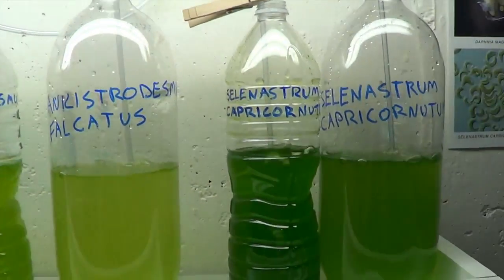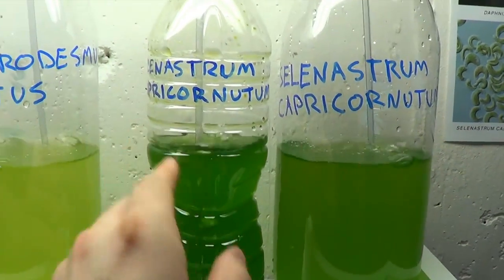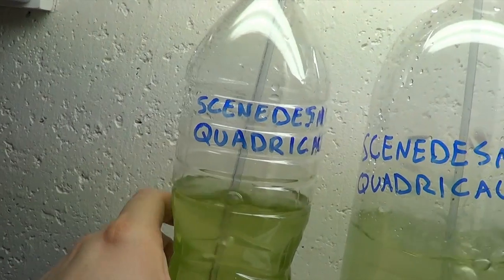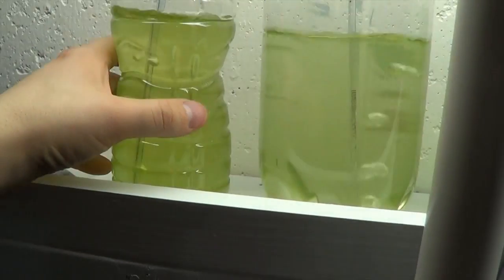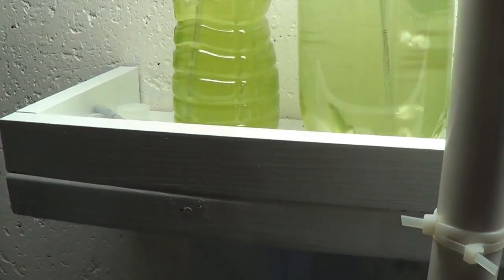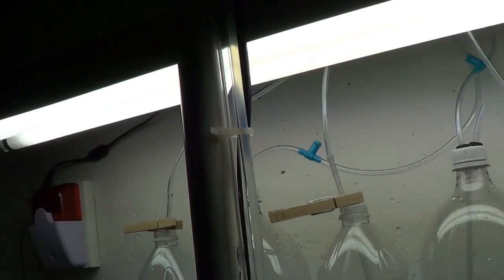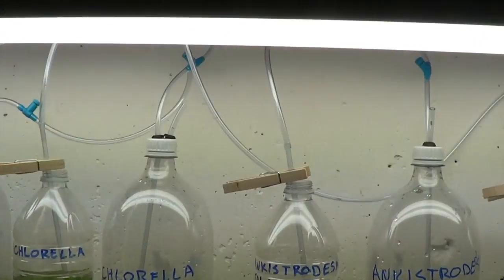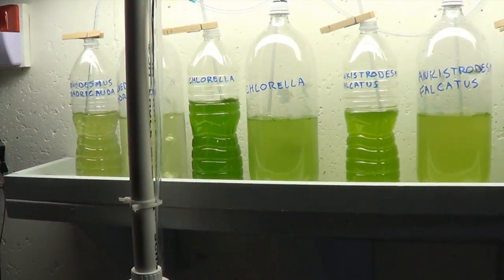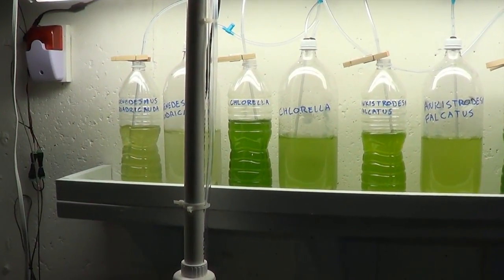So far, in terms of what I've seen, this is the one that's actually given me the best amount of algae so far, at least the darkest color in the bottle so far. And of the four, this is the one that has underperformed the most thus far. Again, I try to keep these suspended by shaking them up a little bit, stirring them up once a day to make sure that nothing gets stuck down in the bottom. And as you can see, I have it on a shelf here down in the basement, and I've got it under basically a cool white fluorescent light, which is about 6 to 8 inches above the top of those bottles. No heat required, really. As long as it doesn't get too hot or too cold, the algae will do fine. And so far, that seems to be the case down here in the basement.